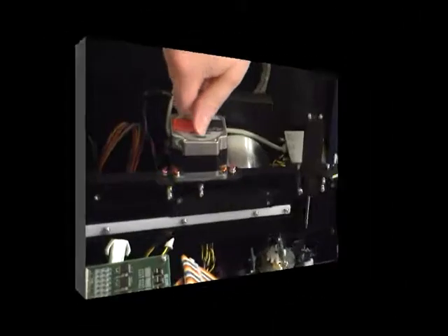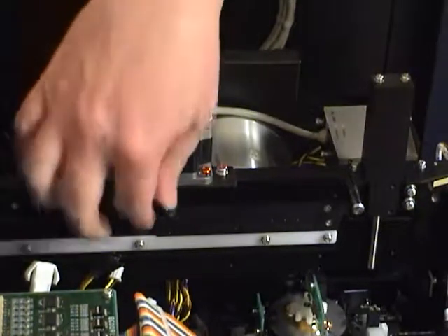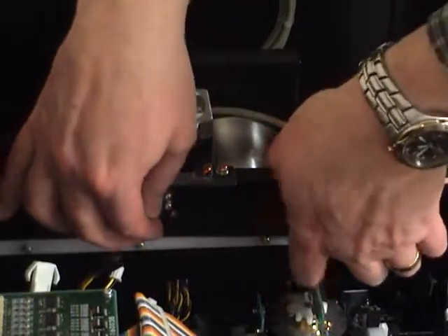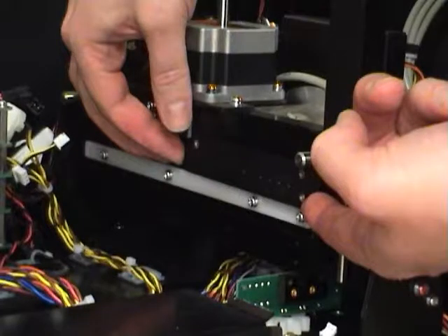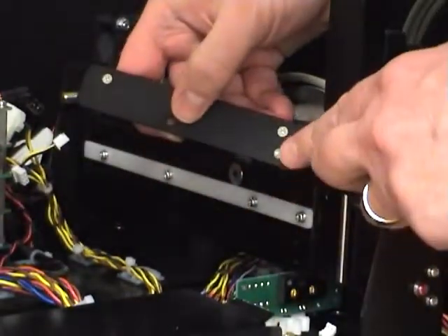First, remove the slide carrier by moving it to the front of the reader. Then slide it out by simultaneously pushing on the back towards the front of the reader and carefully pulling the front of the carrier out to the left. Be careful not to scratch the C14 phosphor capsule.